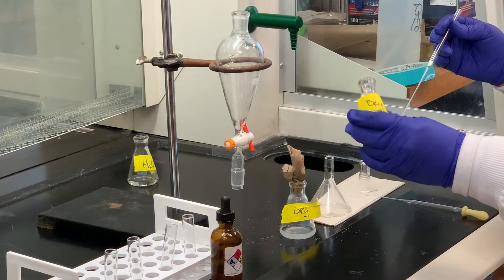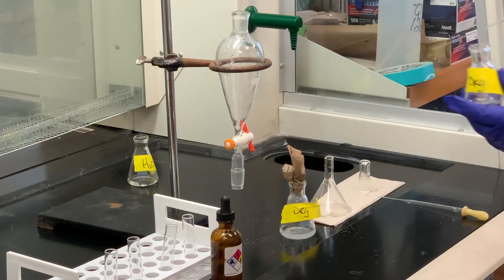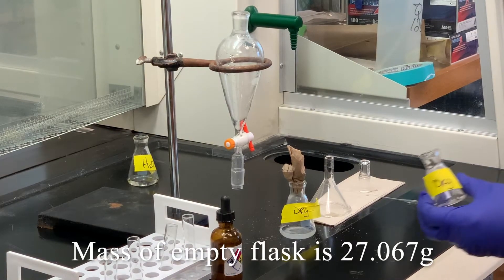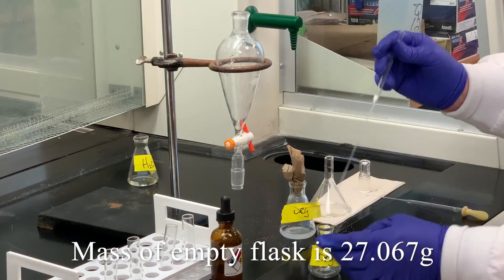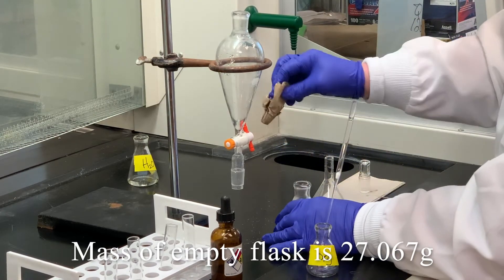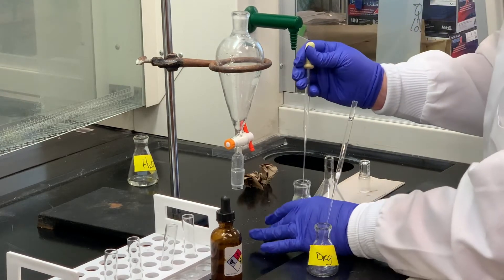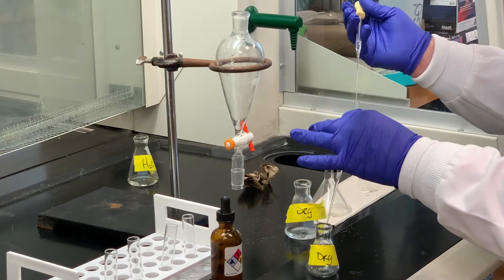I've already gone ahead and weighed a flask that we're going to collect our sample in — the weight of that flask is 27.067 grams. We've got our cotton plug, which is a great way to filter something and typically doesn't take a long period of time. I'm going to take the material here and filter it through that cotton plug.